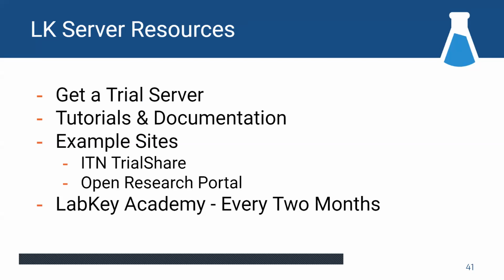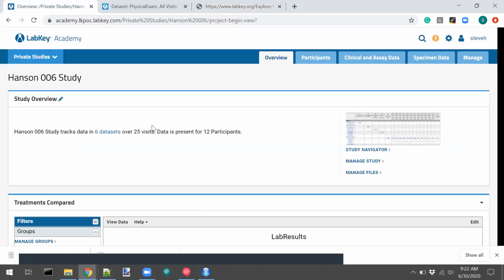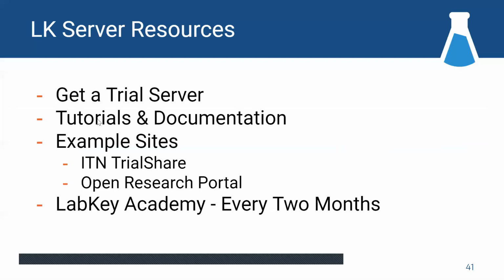And also, I wanted to point you at some of the next steps. If this kind of sparked your imagination, what should you do to keep going? Well, first off, I highly recommend getting your own trial server. All of my work was done on a trial server. I built a trial server to do all this. You can do the same, go through our tutorials, and you can have much the same experience that you saw me go through today. Basically, what I did is I went through a tutorial live today. I went through the set up a new study tutorial. You can do the same, get hands-on with this.